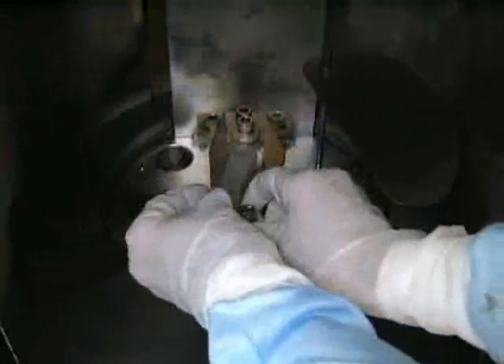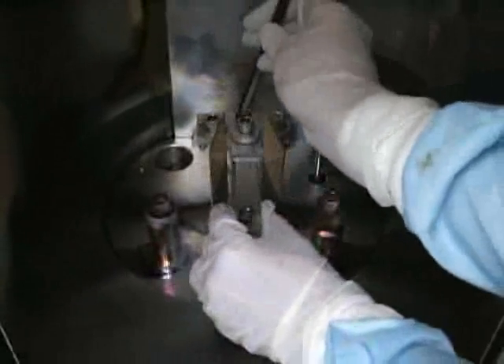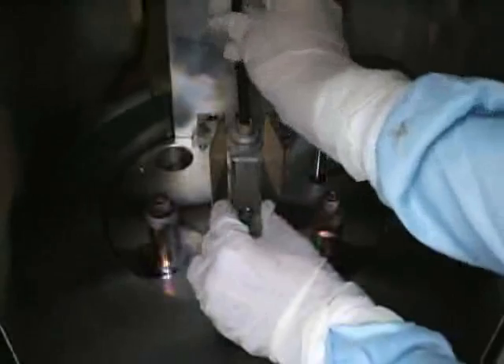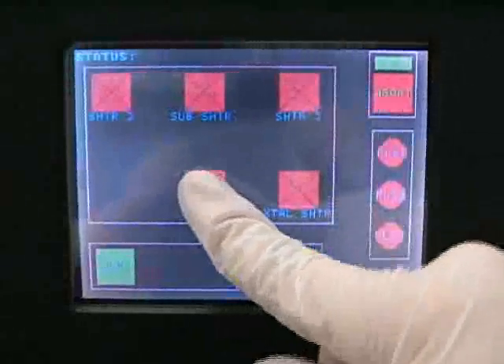The PVD-75 is capable of evaporating multiple metal types per process. For each metal to be evaporated, mount a tungsten boat between a pair of electrodes at the base of the chamber. Once they are in position, place one or two pellets in each of the boats. You should note which electrode pair corresponds to each metal. You should now close the shutter by pressing the shutter 1 button on the depth menu on the front panel touchscreen.